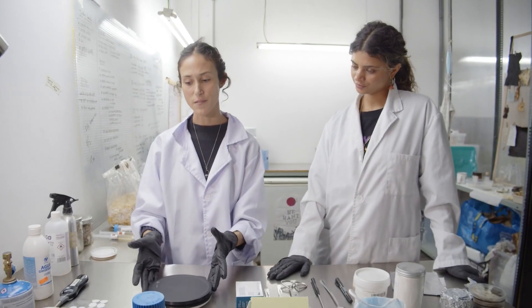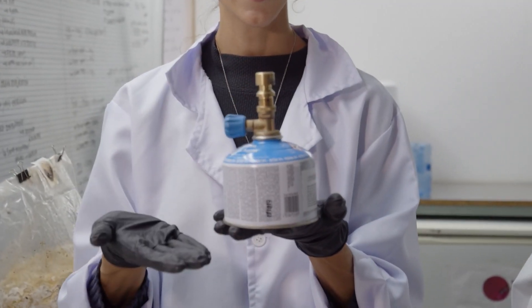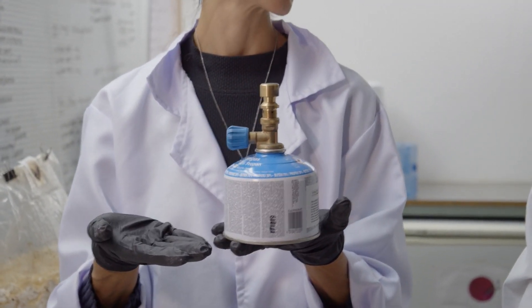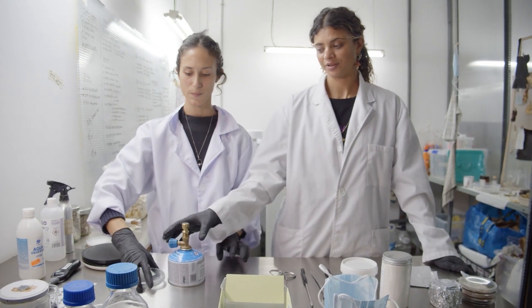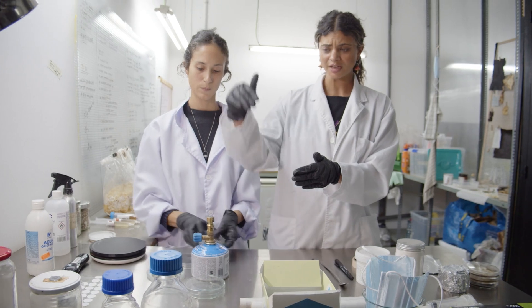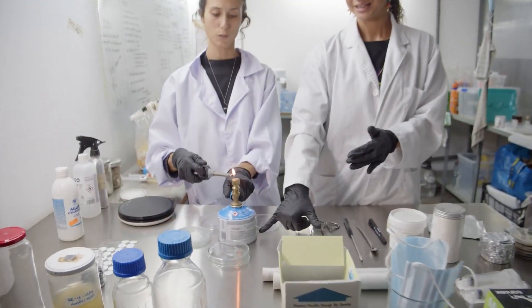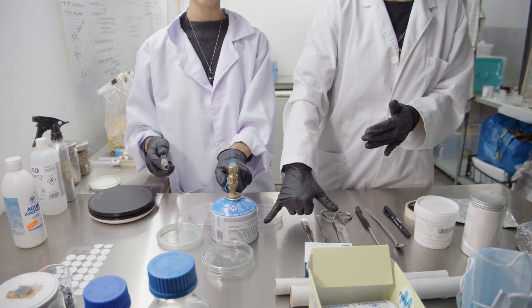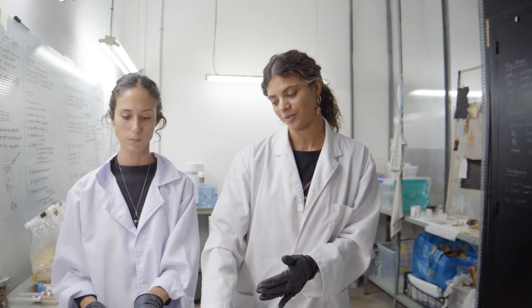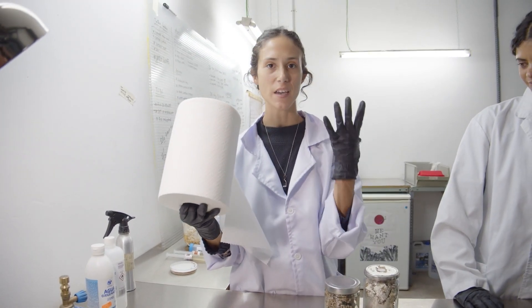Because we don't have a laminar flow hood, we work with a camping stove — essentially a Bunsen burner. The flame creates a convection current that prevents contaminants from falling down, giving you a sterile work surface at roughly a 10 centimeter radius around the Bunsen burner. Paper towels are also essential for wiping surfaces, hands, and plates.